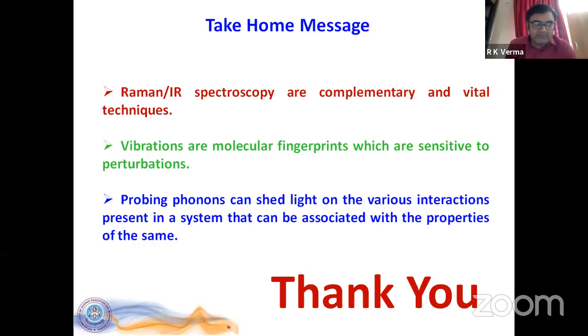Anjali Jain's question is, in FTIR spectrum analysis, which wavelength range shows the material characteristics as we take a spectrum from 400 to 4000 cm⁻¹? Okay, so 400 to 4000 cm⁻¹ is typically useful for molecules or compounds which involve, let's say, hydrogen, nitrogen, and some low mass elements. That's why people who are dealing with solvents or similar agents would mostly prefer to use this range. But when we're talking about compounds which have high Z elements, for example heavy mass elements, then one has to go below 400.